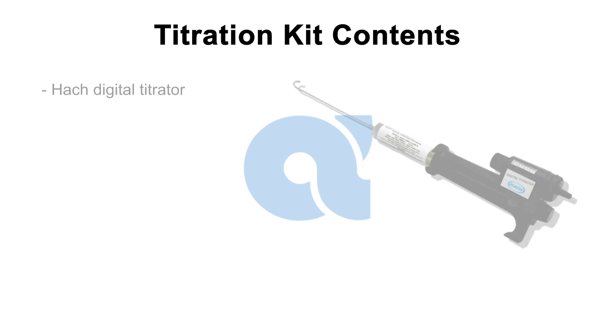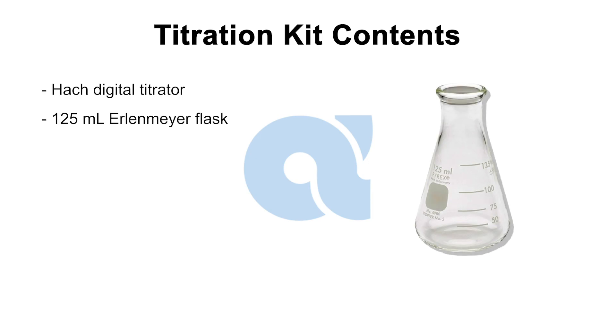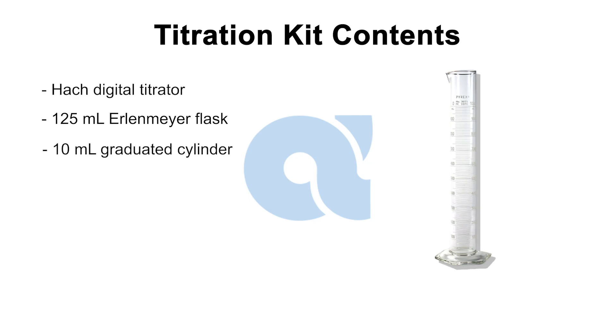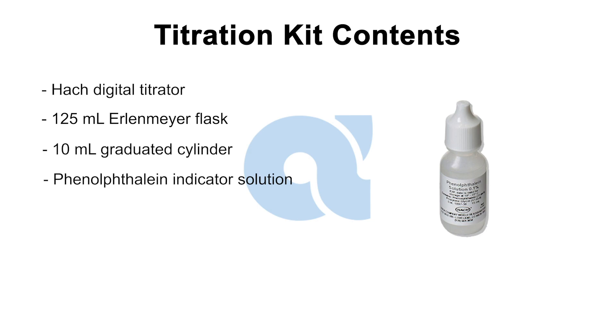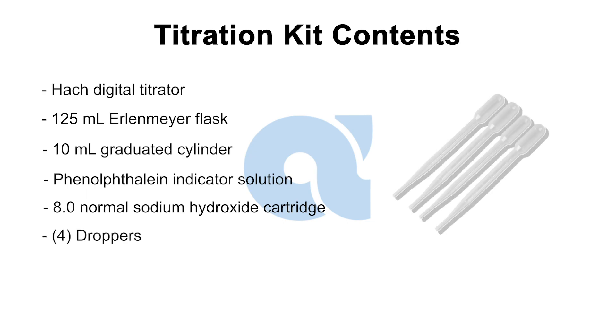First, we have the Hach digital titrator. We will set this up during step four. Next, we have a 125-milliliter Erlenmeyer flask. The kit also includes a 10-milliliter graduated cylinder, a container of phenolphthalein indicator solution, and a container of 8.0 normal sodium hydroxide cartridge. Finally, there are four droppers included with the kit.